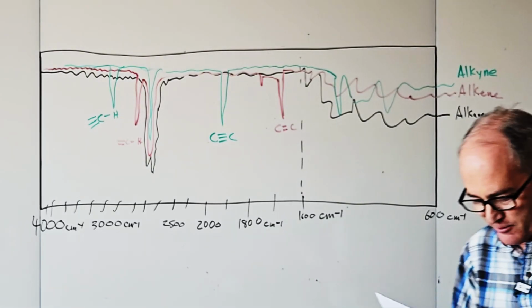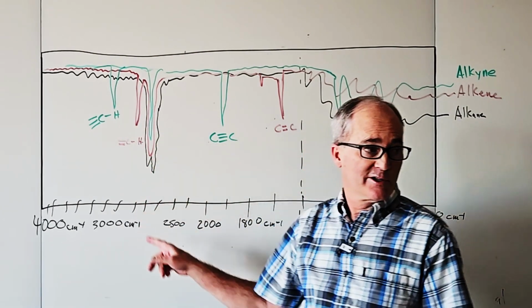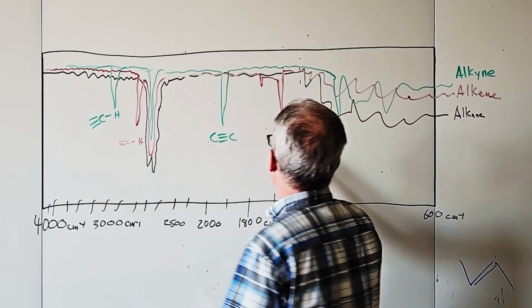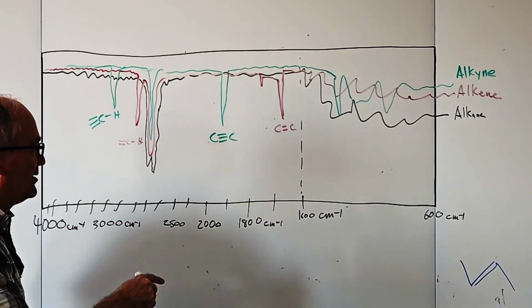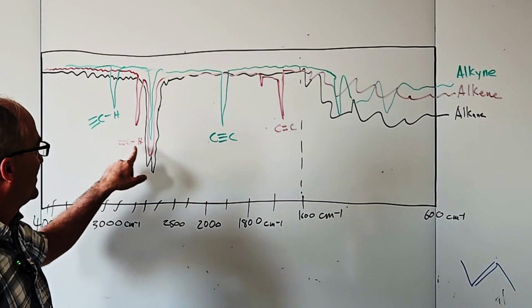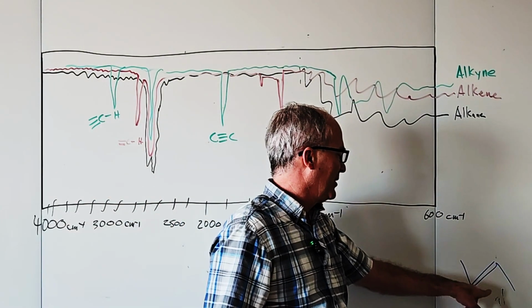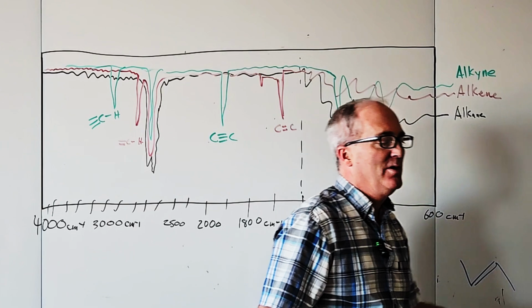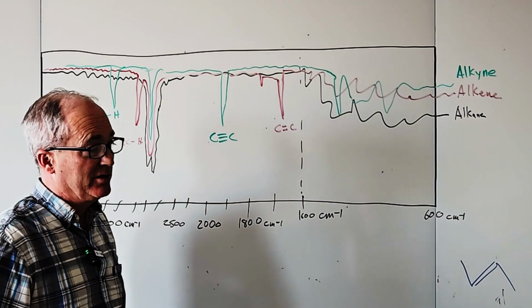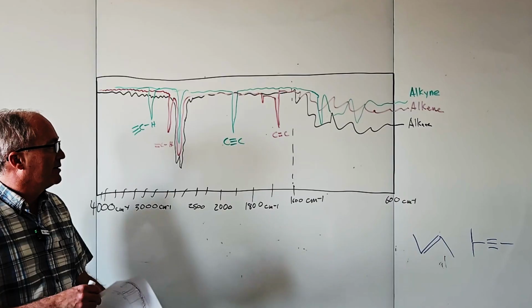So there's our alkyne. A terminal alkyne, you'll see these hydrogens. Yes. If you have some internal, you'll still see these, but you won't see these. When you have a terminal alkyne, you'll see this stretching. When you have a terminal alkene, you'll see this stretching. These are not terminal alkenes or alkynes because there's no hydrogen bonded to the triple bonded carbon, or more importantly, to the sp hybridized carbon or the sp2 hybridized carbon.